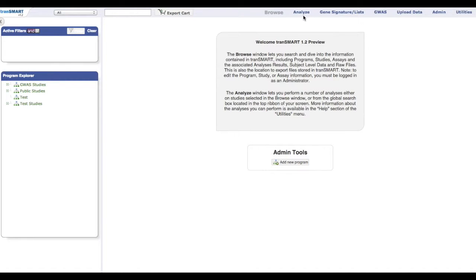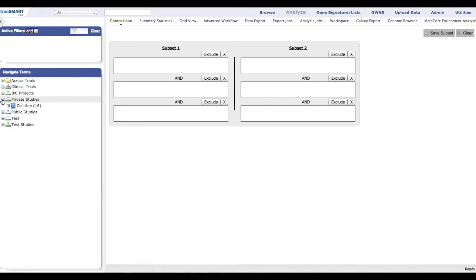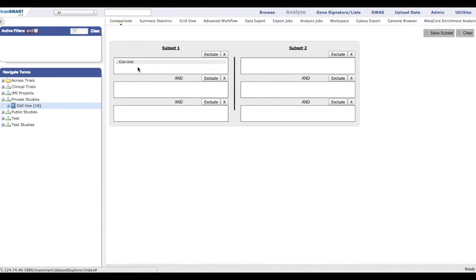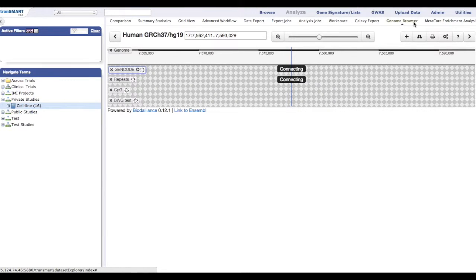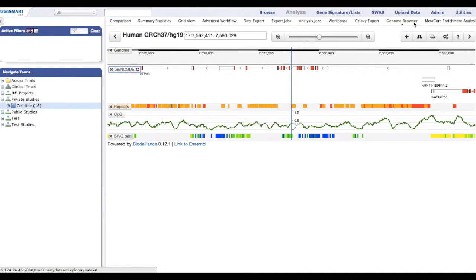To view the Genome Browser, click on the Analyze tab at the top of the menu bar. From the Navigate Terms box on the left-hand side, click and drag the study onto the main display. After dragging the data over, click the Genome Browser link on the top submenu bar.